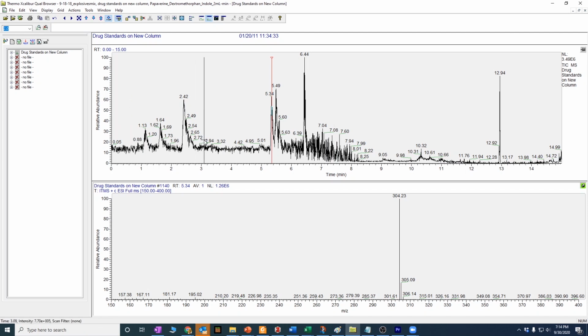Okay, but this is a pretty ugly spectrum. The first thing is, this run ended at 8 minutes. I should have turned the detector off, because the rest of this is not analytically useful. I've left it on this spectrum because I want to show you something, but the rest is not analytically useful. If my run was done in 8 minutes, why would I keep going?